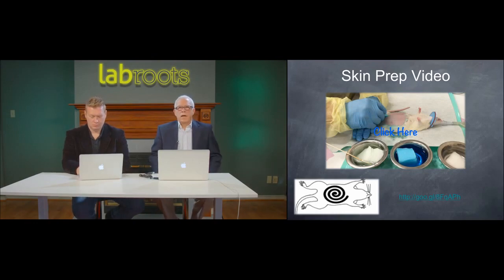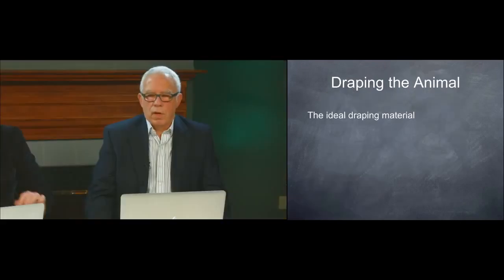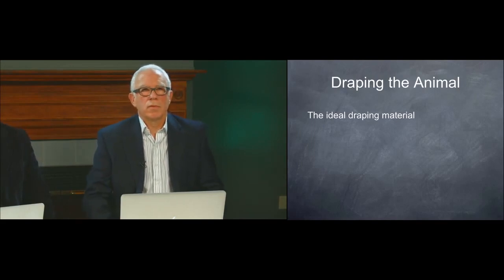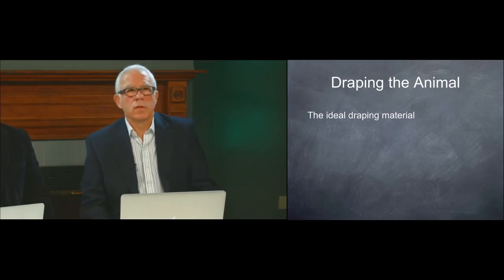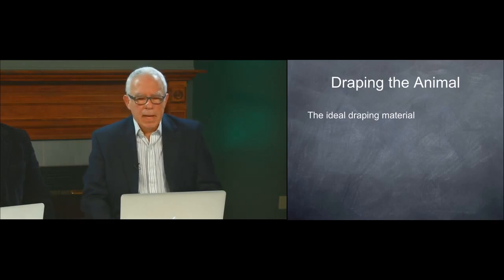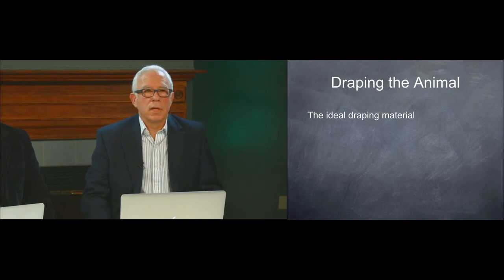So draping the animal. Every animal should be draped. In fact, remember the Dr. Jones story? The individual was doing stereotaxis surgery and the animal's head was not draped. Many investigators will say it is too inconvenient to drape the head. Well, I think it can be done. It can be done very easily. And it needs to be done in just about every surgical procedure.